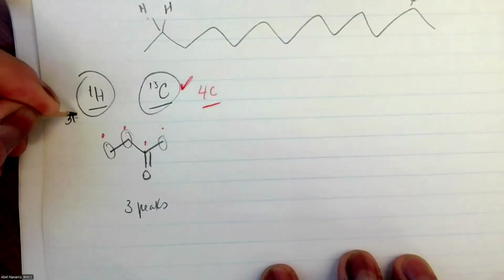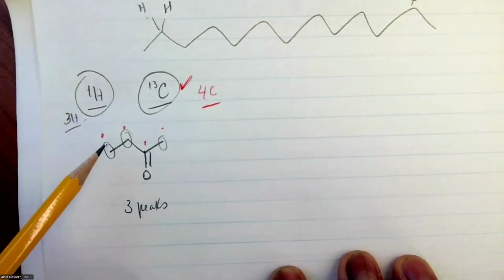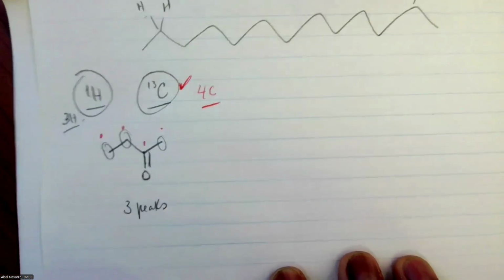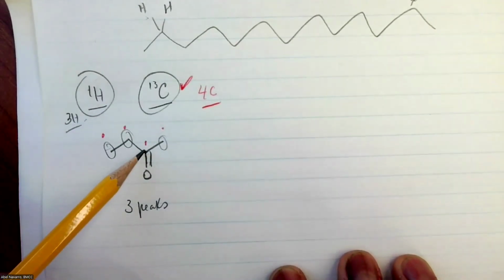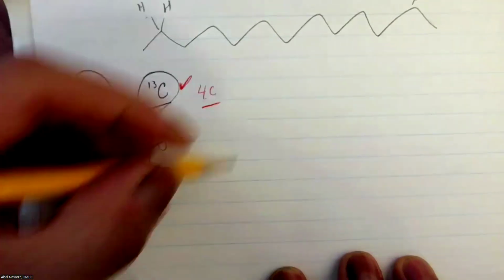Here, 3 H's, right? Three hydrogen signals. In the carbon one, right? There is no plane of symmetry, therefore they're all different. Carbon. Now we see this carbon because this is a carbon. Four carbons. 1, 2, 3, 4.